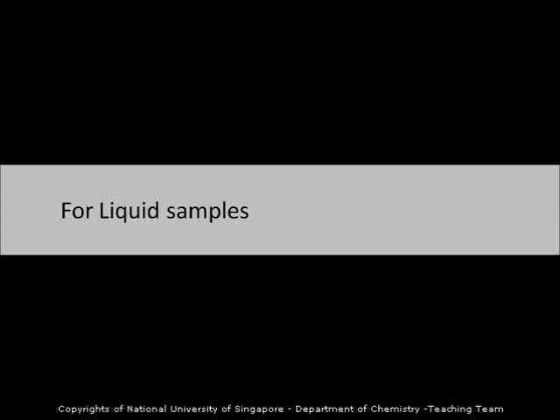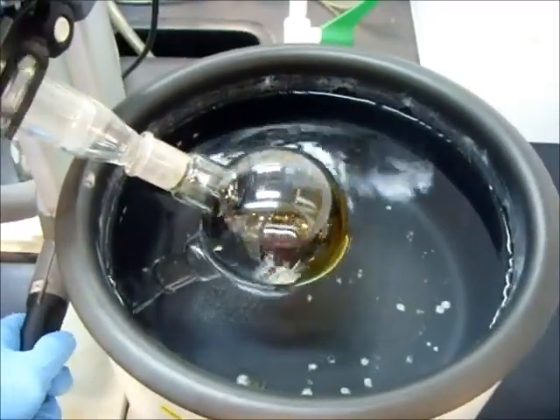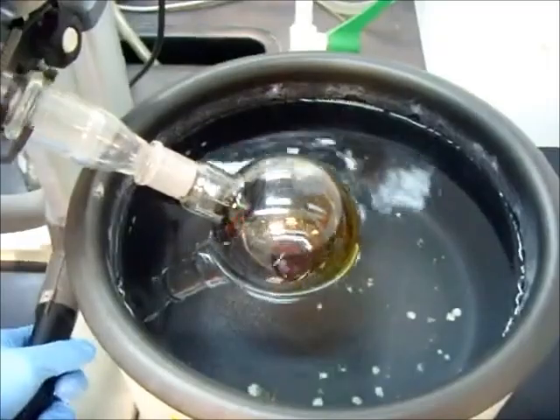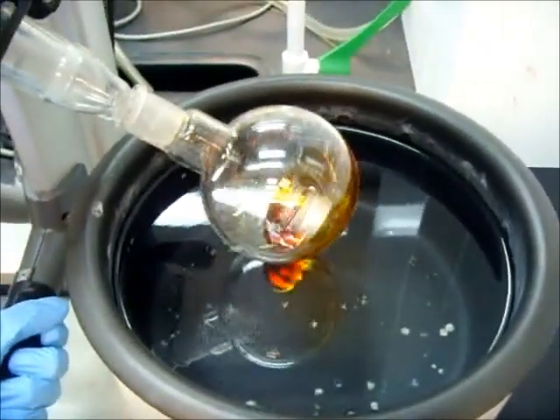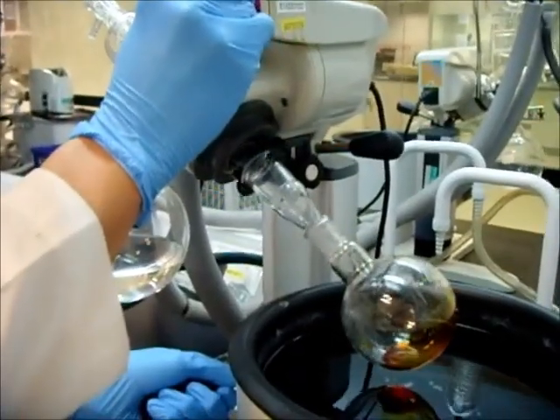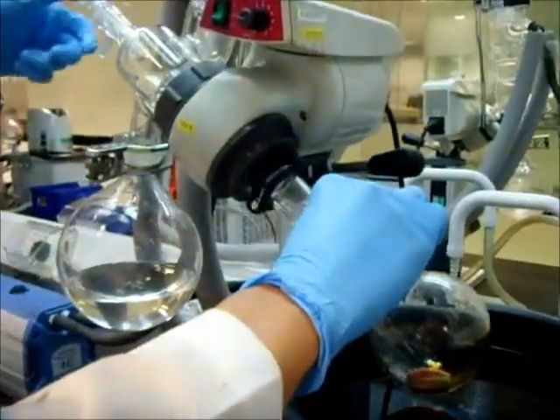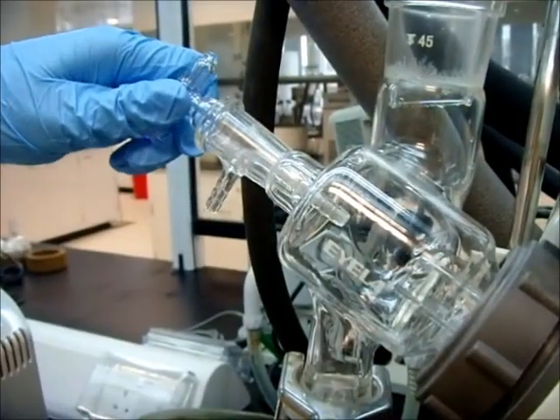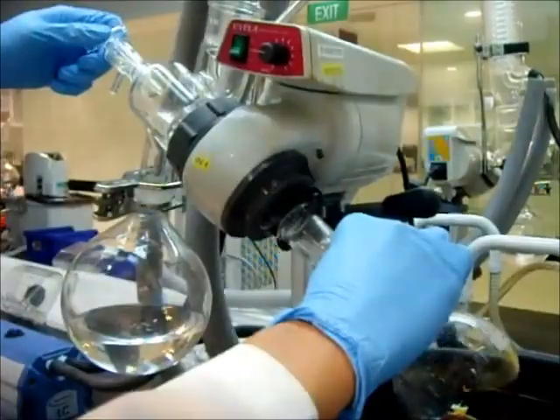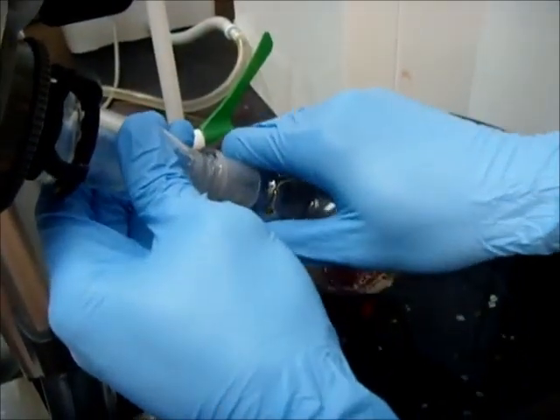Here is what you will see for a liquid sample. After some time, you will notice that there are no more solvents inside the round bottom flask. Turn and lift up the lever. Adjust the rotation speed to the lowest. With your right hand holding the round bottom flask, use your left hand to slowly and gently turn off the vacuum. Switch off the aspirator, and using both hands, slowly rotate the round bottom flask out of the adapter.